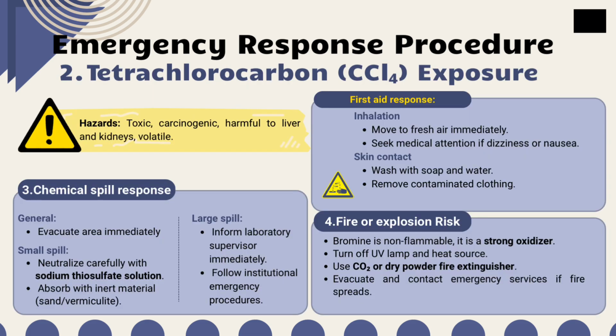Next, tetrachlorocarbon is a toxic and carcinogenic solvent that can damage the liver and kidneys. If inhaled, the person should be moved to fresh air and medical attention should be obtained if symptoms such as dizziness and nausea occur. For skin contact, the affected area should be washed thoroughly with soap and water, and contaminated clothing should be removed.